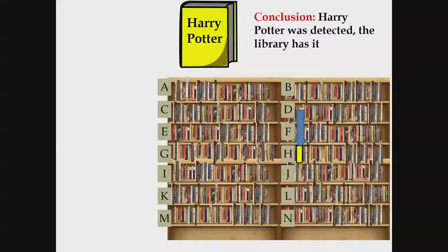So the idea here is, can we make use of prior information that we know about where a peptide should be, where it responds, which peptides respond well for given proteins, in order to expedite and improve our ability to, one, detect it, and then to quantify it later in future experiments.